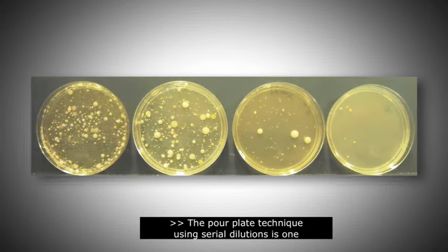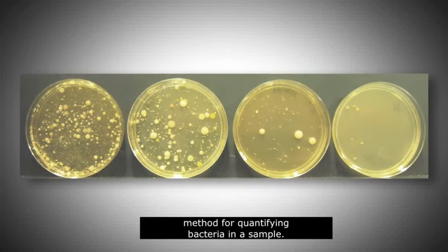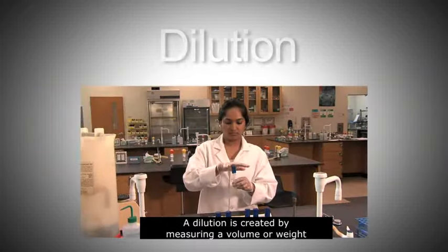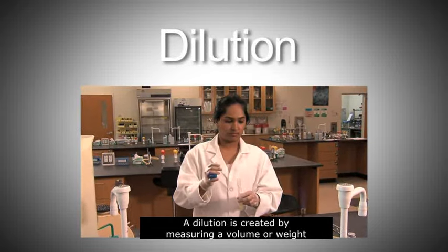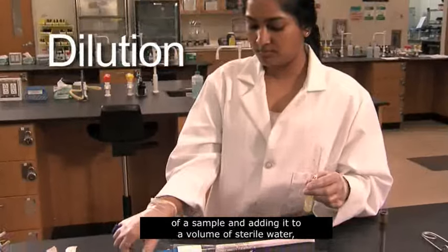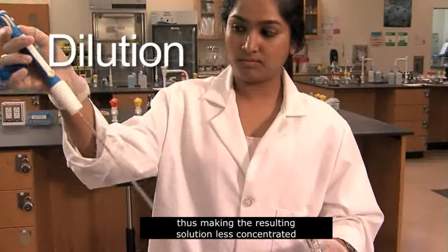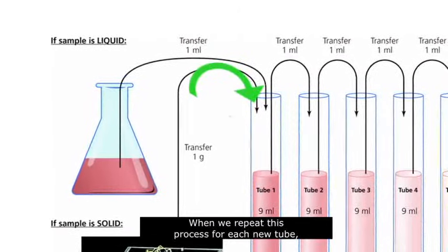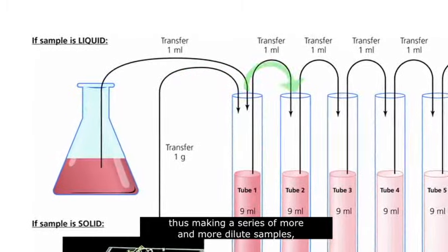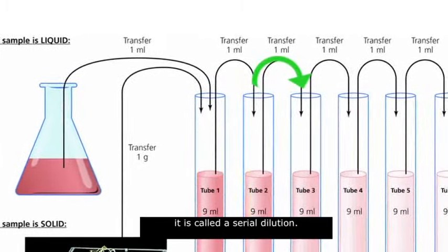The pour plate technique using serial dilutions is one method for quantifying bacteria in a sample. A dilution is created by measuring a volume or weight of a sample and adding it to a volume of sterile water, thus making the resulting solution less concentrated than the original. When we repeat this process for each new tube, making a series of more and more dilute samples, it is called a serial dilution.